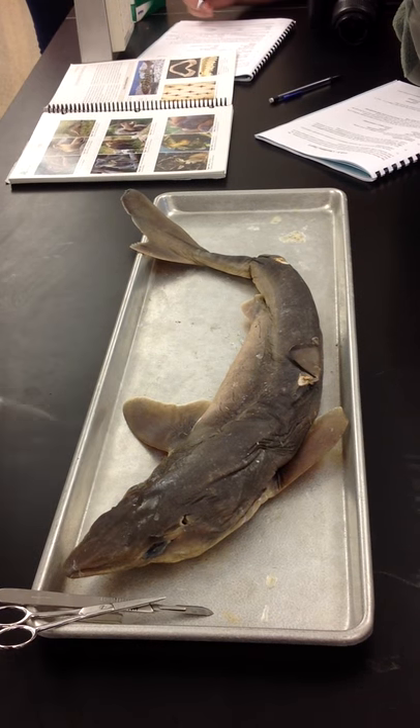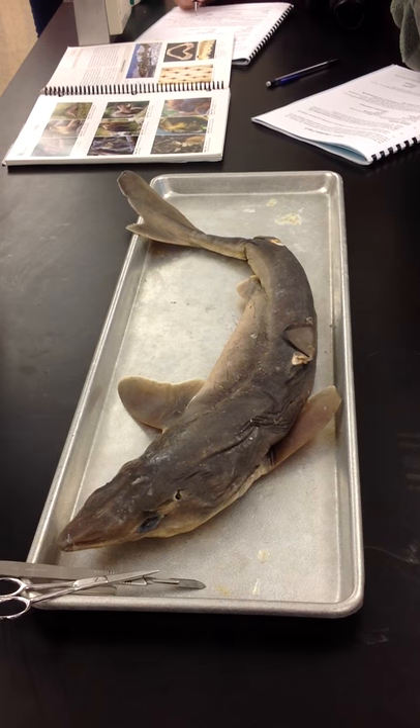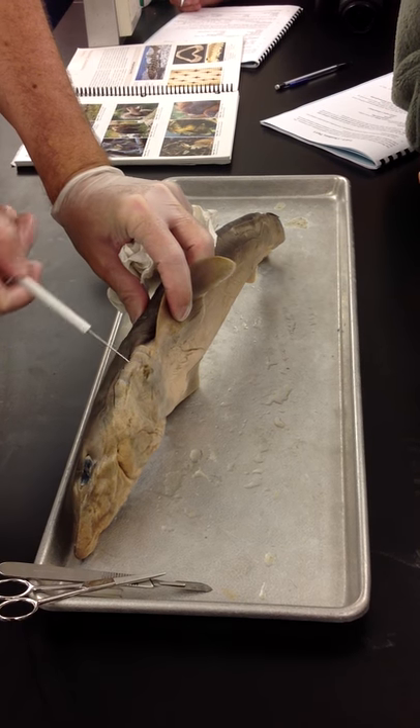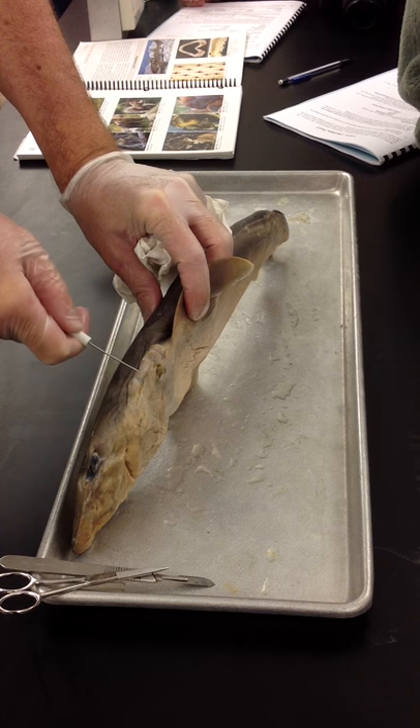The eye is, of course, the eye. Gill slits are what we tend to think of when you see the side of the shark's body — you've got all the nice little gill slits opening up on the side of the body.